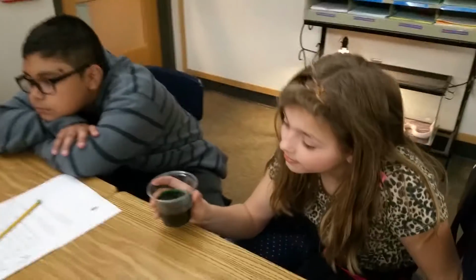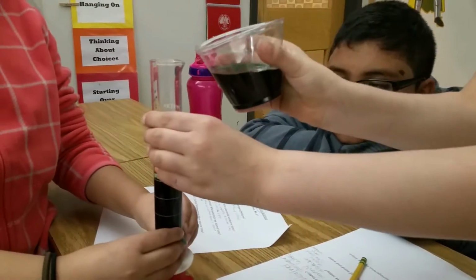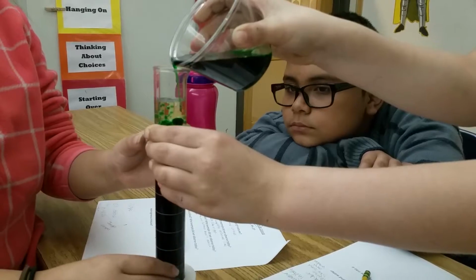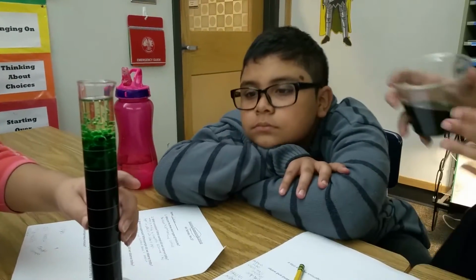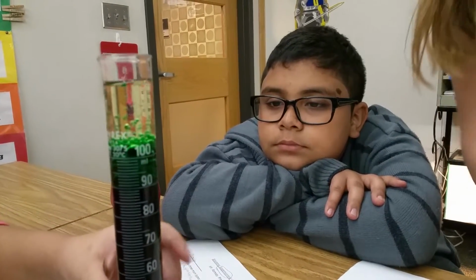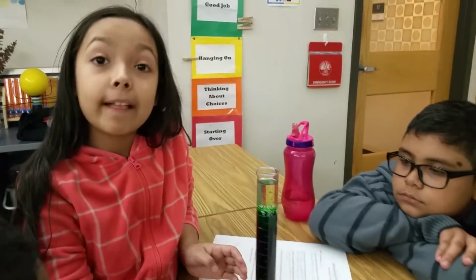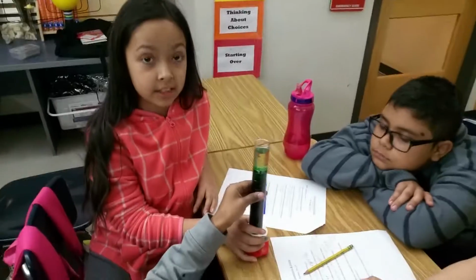Over here, I've got table 1, and you guys have another one here. It looks like, Izzy, you've got something to pour in there. Why don't you try it, Izzy? Let's see what happens with yours. Good job. Let's see if that's mixing, if it's dissolving. It doesn't look like it wants to dissolve, does it? No. What's that on top there, Joel? Oil. That's the oil that isn't mixing. So, Jocelyn, is this a colloid or a suspension? Suspension. This is a suspension. Good job.